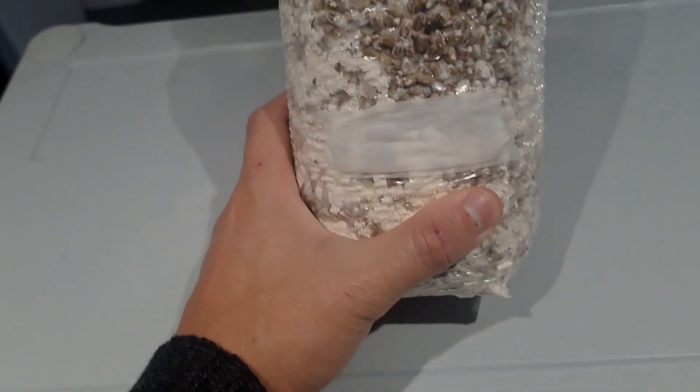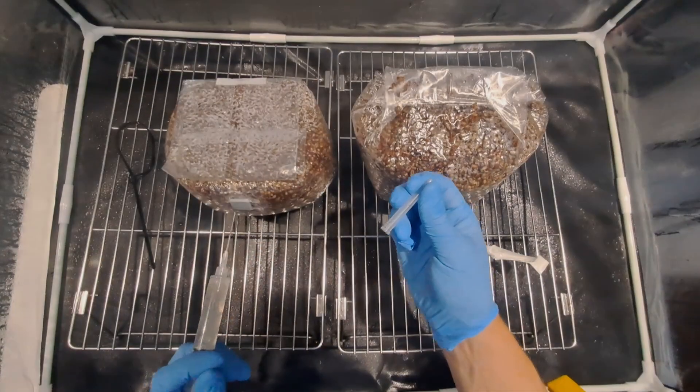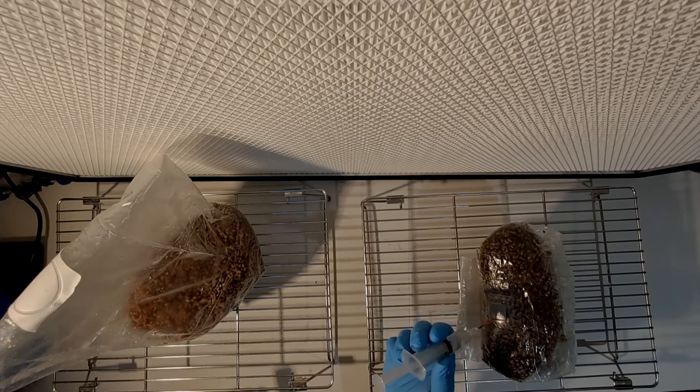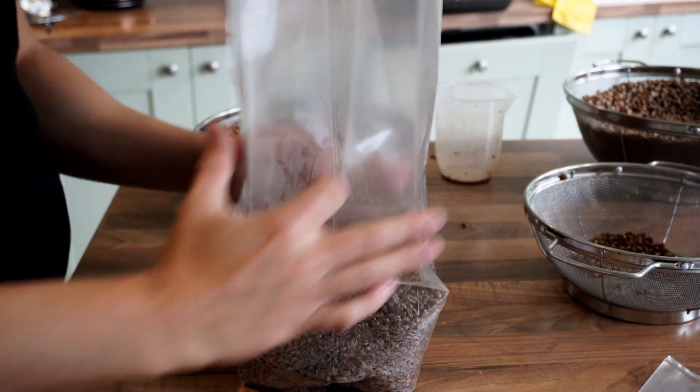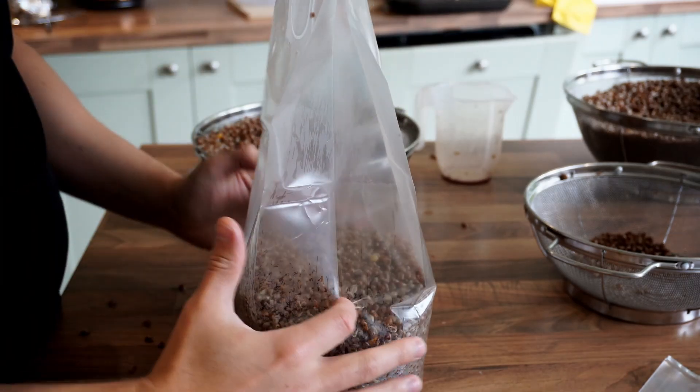In this video I'm going to show you how to inoculate grain bags inside a still air box and also in front of a flow hood. I'm quickly just going to discuss how you prepare your bags for sterilization in the pressure cooker.